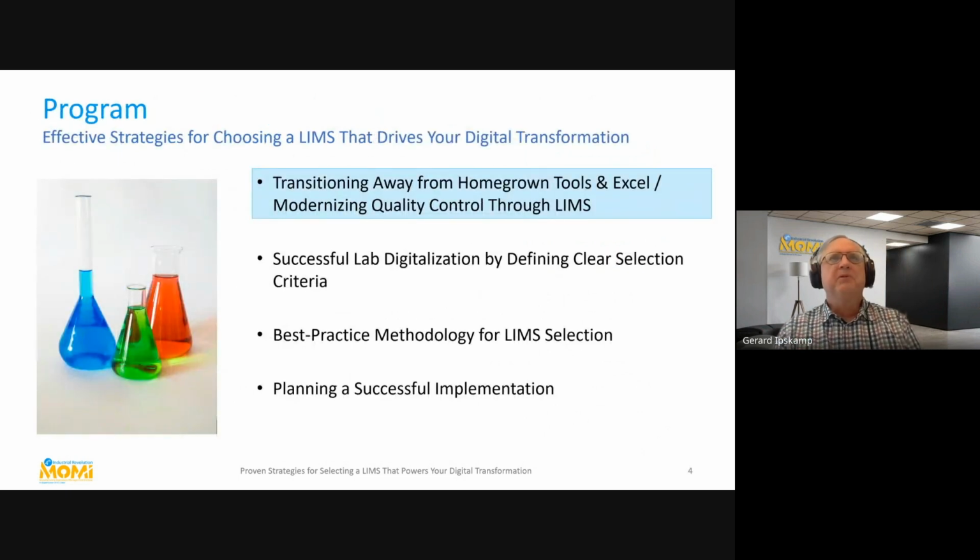The program of today is 4 chapters, 4 parts. I first want to talk a little bit about Excel and compare that with LIMS. Then what about criteria? How do you select a good LIMS for your situation? Then the methodology itself.